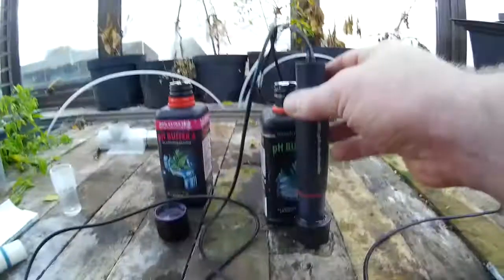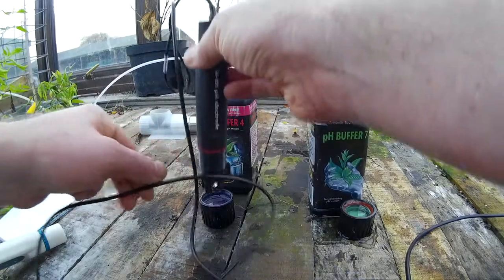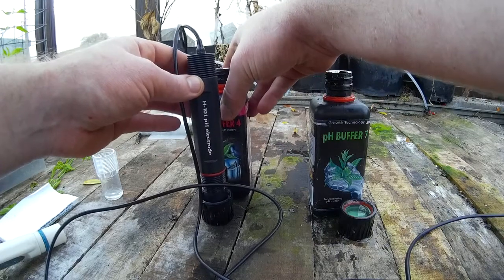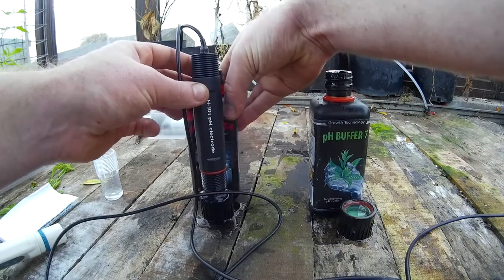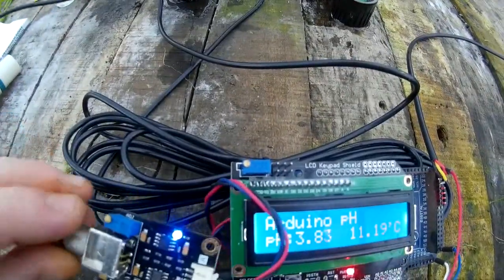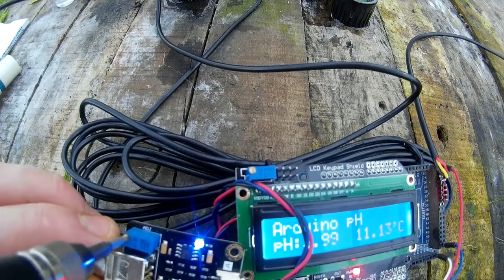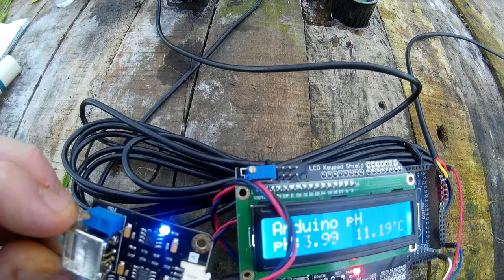Take your probe out of the pH 7, shake it about, and place it in the pH 4 buffer. Give it a little shake to make sure there are no bubbles. As you can see, it's not saying pH 4 — it's quite a bit off. So how you adjust that is you get the probe just here and adjust this little blue potentiometer until it says 4. There — it says 4.